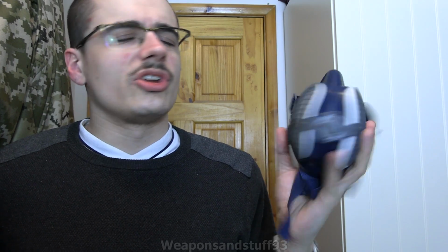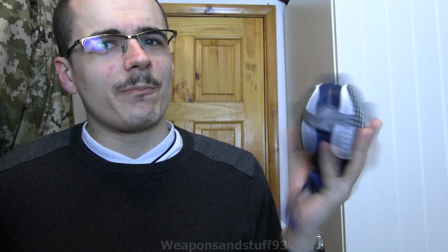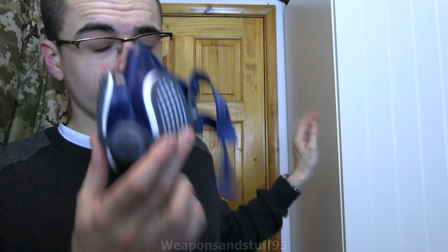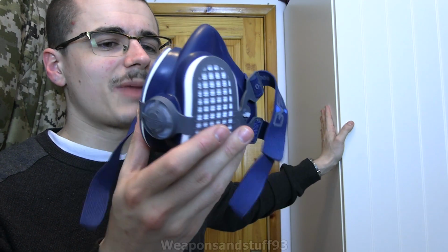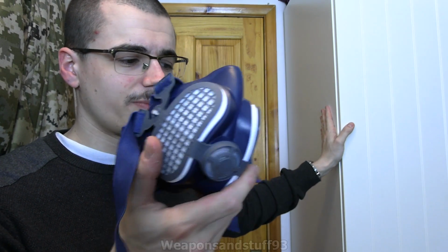Right, anyway. So yes, the GVS Elipse seems very good. The only thing I'm not sure about is removing the filters and putting new filters in. Could you damage the filter medium by pushing them in that way? Who knows, but in terms of, is it a bad mask? Certainly not from what I can tell. Is there quality control issues with other ones? Who knows, but in regards to this one, this is absolutely fine. So, yes, I would recommend this based on my quick initial assessment.